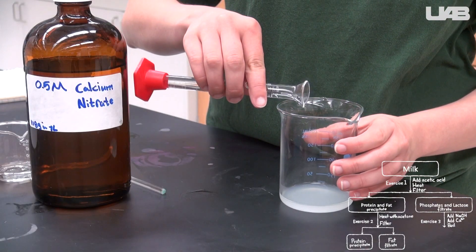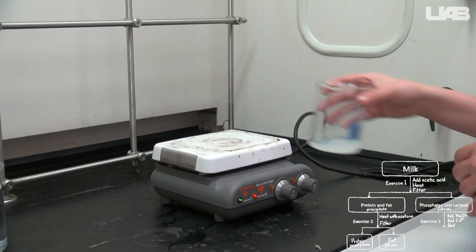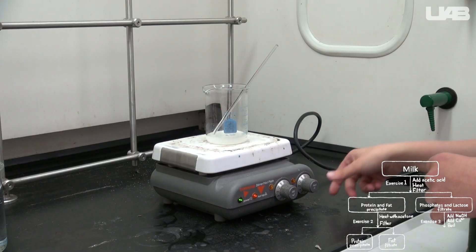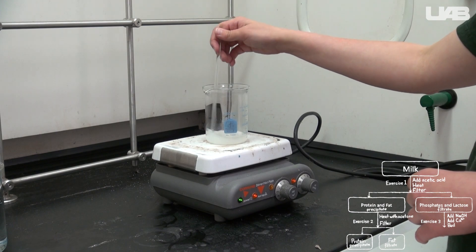Add 10 milliliters of calcium nitrate and move to the hot plate. Heat it on a medium setting while stirring until the volume has been reduced by about 1 third. This will take about 15 minutes.